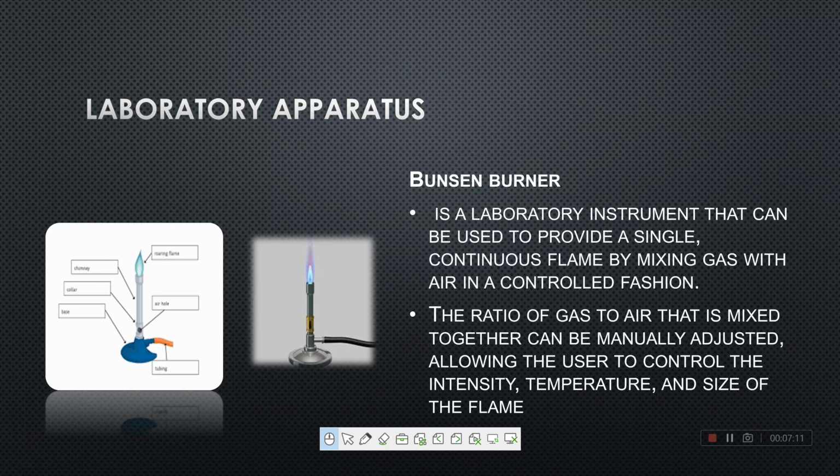Alright, here you can see in this picture, Bunsen burners are widely used in the clinical pathology laboratory and microbiology laboratory as well. These are used to heat the solution. What they do is provide a single continuous flame by mixing gas with air in a controlled fashion.